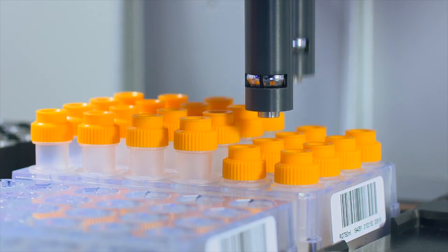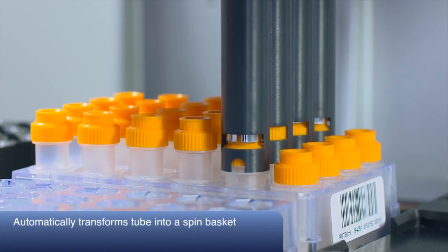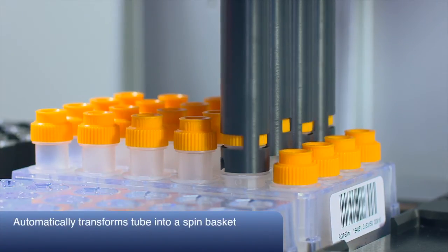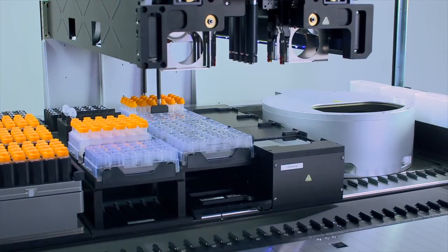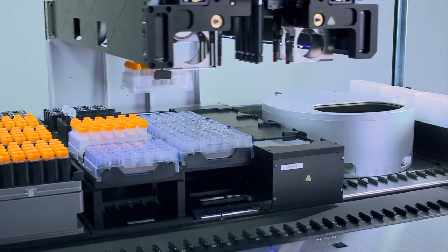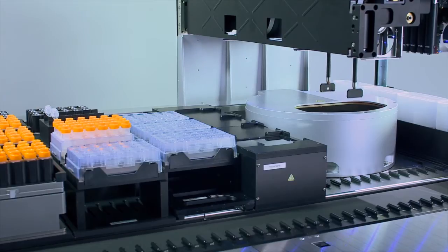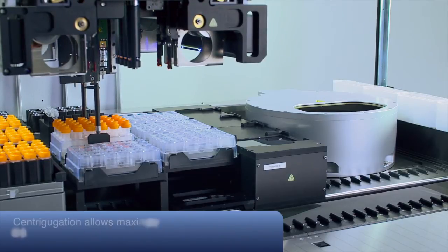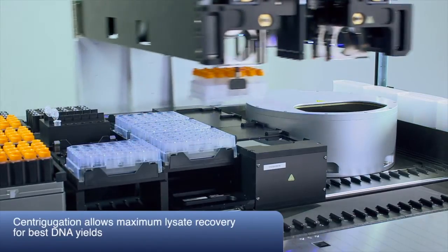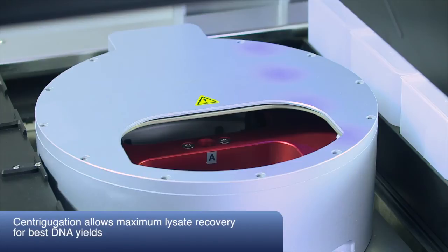The Autolis channels then perform the lift and lock function, transforming the Autolis tubes into spin baskets by lifting the inner tube and locking it in position. To separate the lysate from cellular debris and sample support — for example, swabs, cigarette butts, and any other solid material — the Autolis racks are centrifuged. The lysate goes through the sterile filter membrane of the inner tube, resulting in a clear lysate in the outer tube.